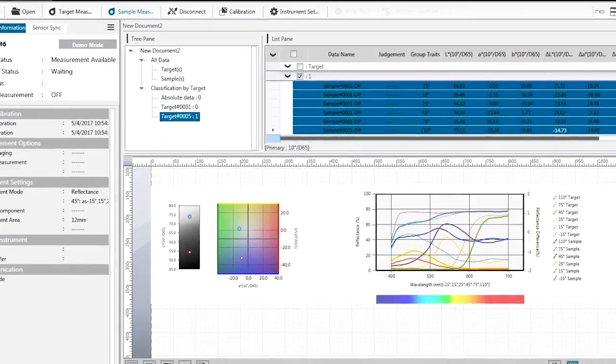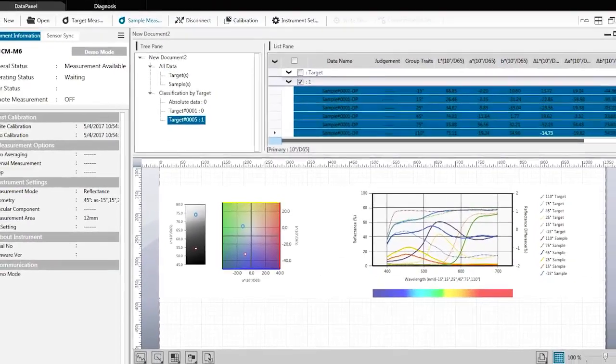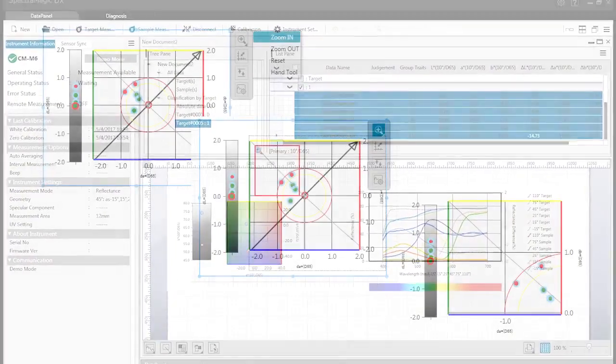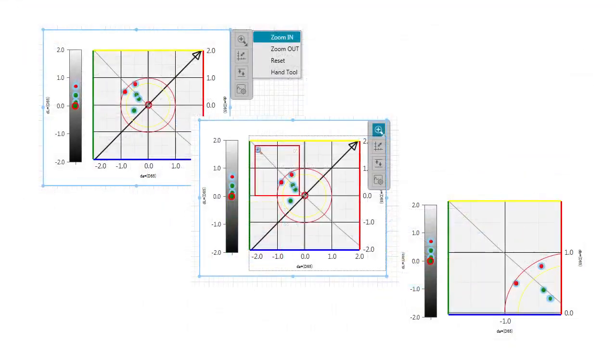You can obtain pass-fail to more sophisticated analysis with spectral, color, and trend graphs.